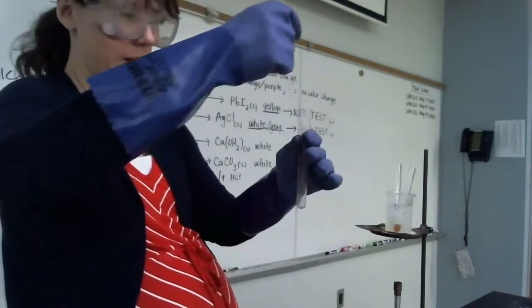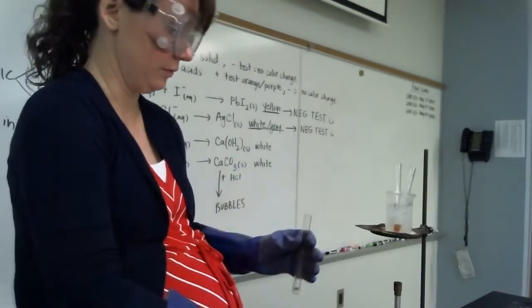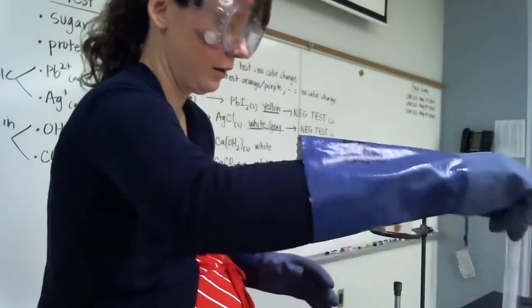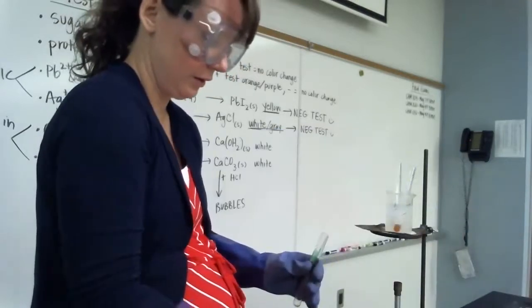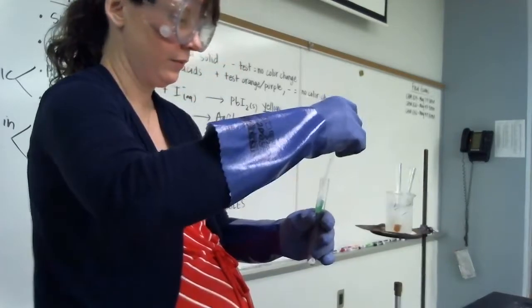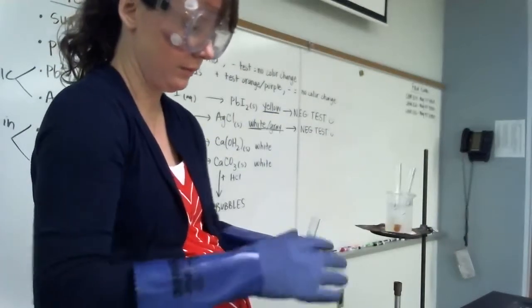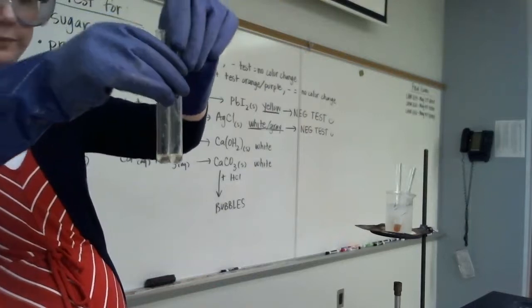So let's take some of our lake water. Here is for test number 1. And this is a cleaner one. Here is for test number 2. All right, so we've got 2 initial samples here.